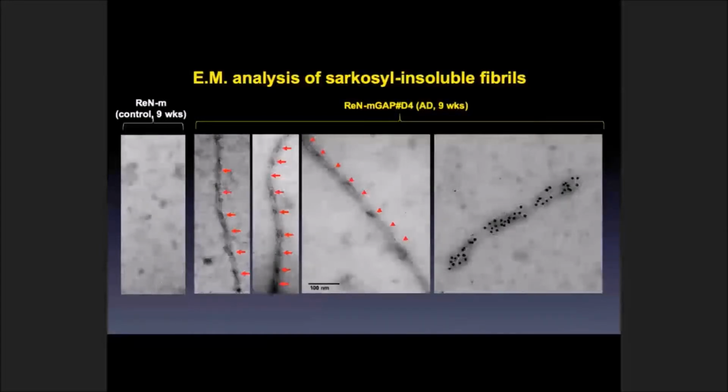As you know, there are several structures in neurofibrillary tangles, but the well-known structure is PHF, paired helical filaments. That's actually the signature of tau aggregation. The average pitch size is about 120 nanometers. This type you can only see in Alzheimer's patient brains, not in other tauopathies. So that's another confirmation that this model closely recapitulates tau pathology in patient brains.